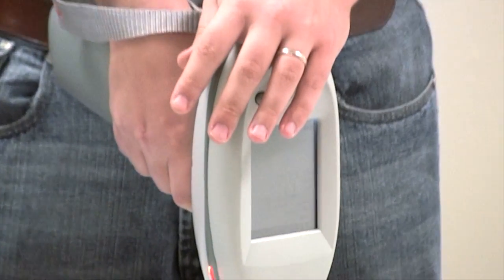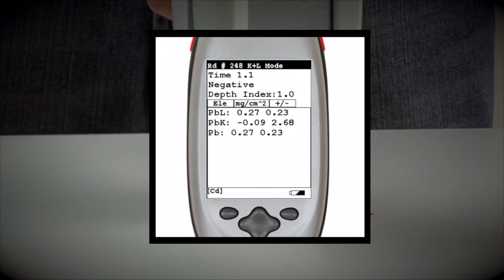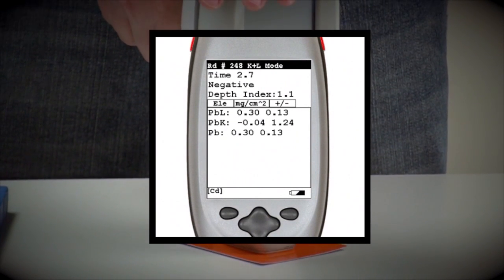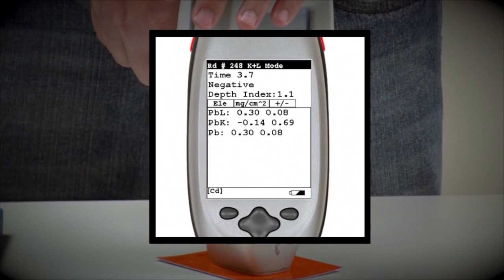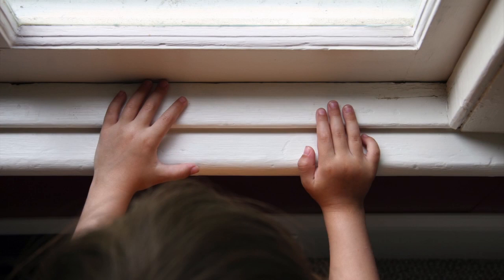Because we use a cadmium-109 source, you receive the longest source life of any other instrument available, with the ability to report both the K and L shell, making you more productive, with more accurate, legally defensible results. There is no room for error in testing and measuring lead in paint.